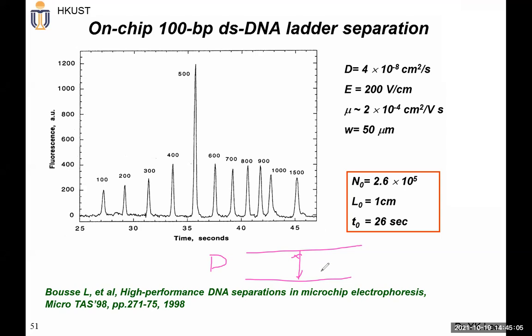That is quite important. If you look at this paper, they also demonstrate that a microfluidic channel can create much better performance for DNA separation.